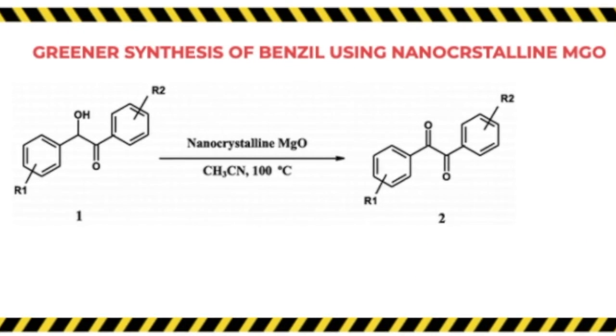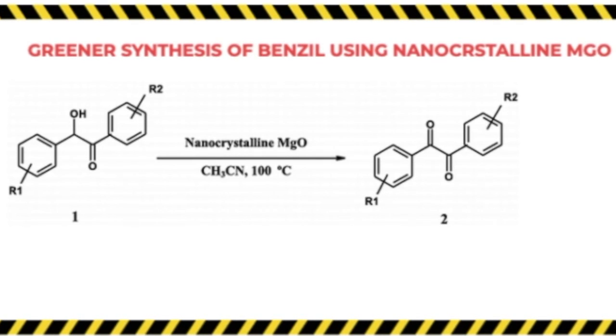Alright, so in the previous portion of the video, I did mention that a catalyst would be added, the MgO. That was incorrect for that portion of the reaction. That reaction is going to have the nitric acid. That nitric acid is an extremely volatile compound, very irritable, very harmful for our environment. And the overall goal of green chemistry is to be able to synthesize the same product, if not even better products, with the overall goal of producing less waste, or if we have to produce waste at all, a less harmful form of that waste. And that's what we're going to be discussing here in this reaction pictured above.